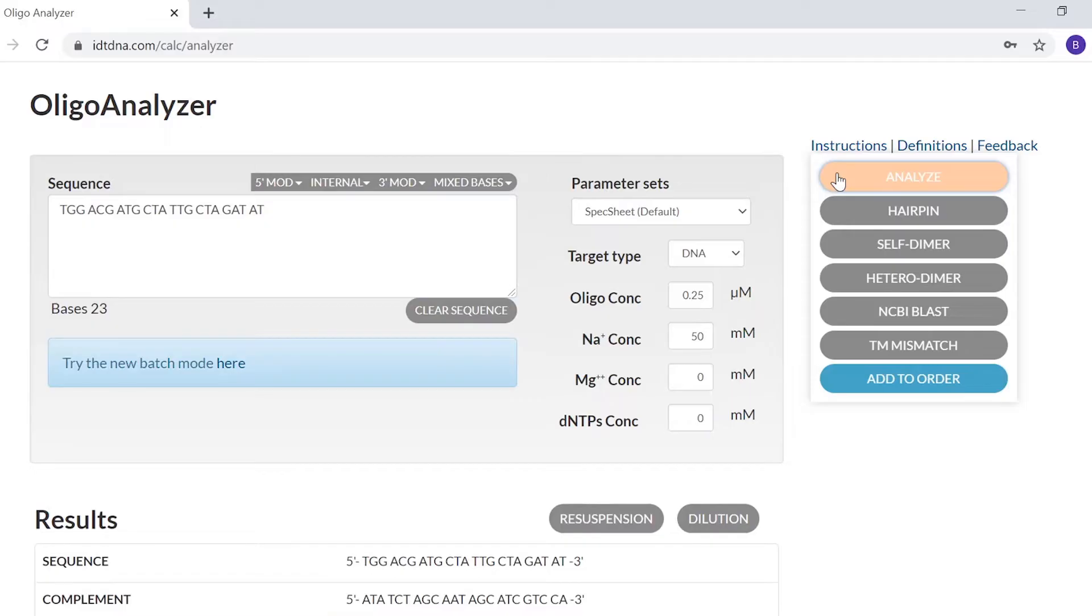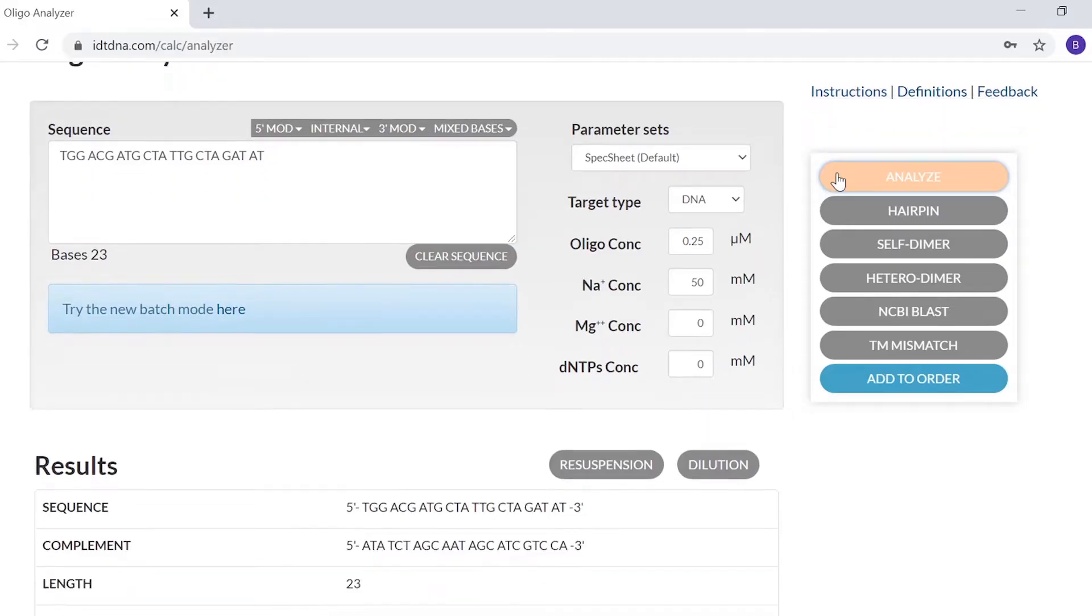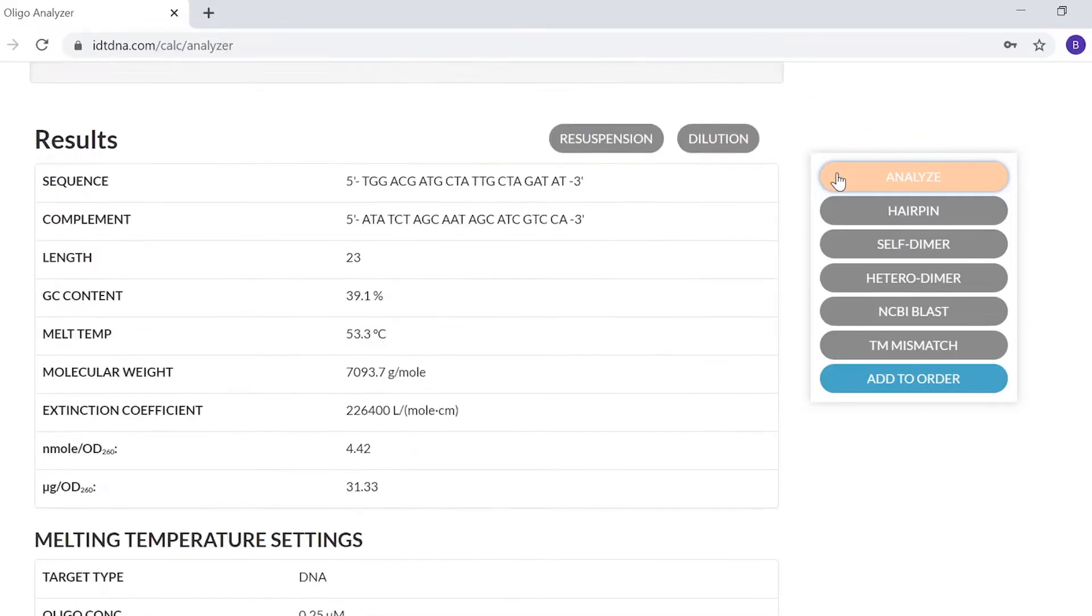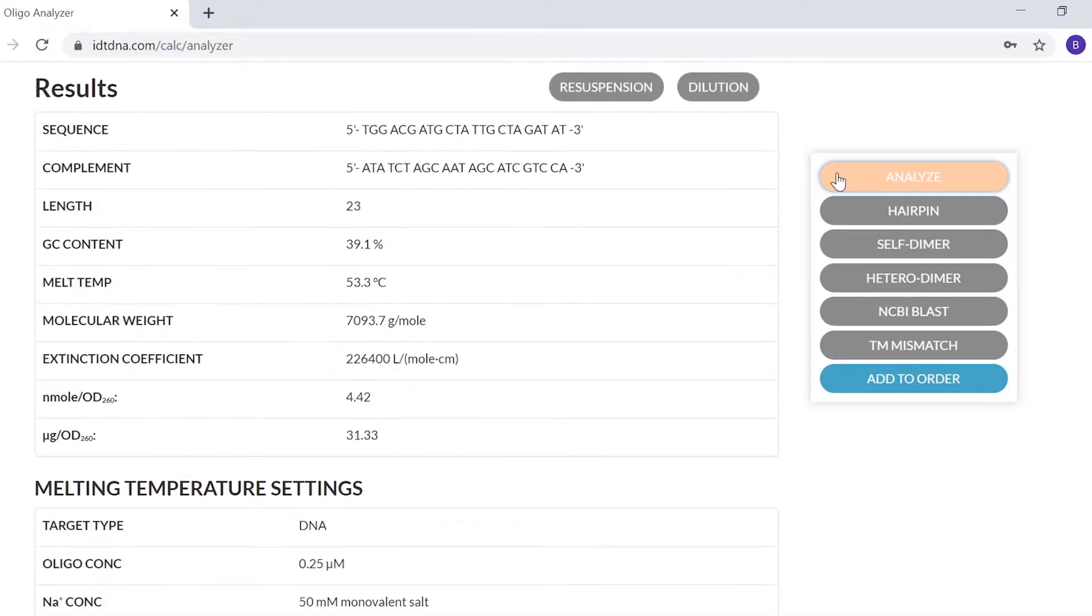By selecting the Analyze button, you'll get an overview of physical properties of your sequence, including sequence characteristics, melting temperature, and conversion factors for concentration calculations.